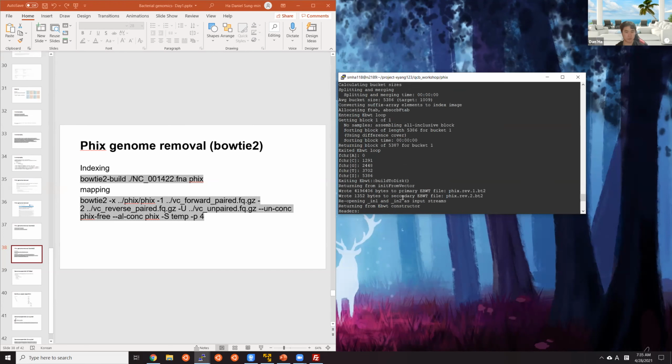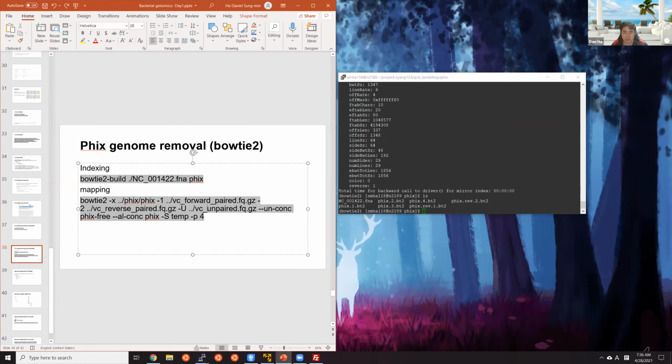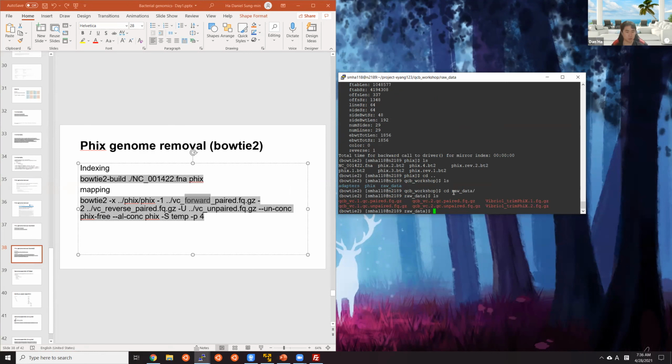Yeah, so if you have done everything correct, you will have these printouts, and then the index file being generated, right? Actually, let's copy the quality filtered data from the Trimmomatic folder. So we have the QCB files here that we just quality filtered with Trimmomatic.